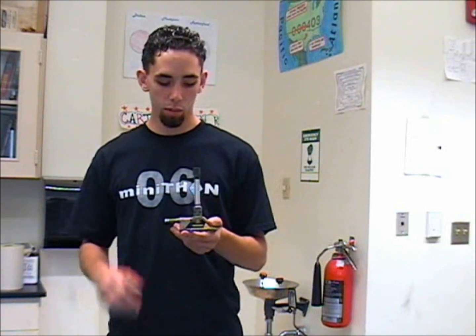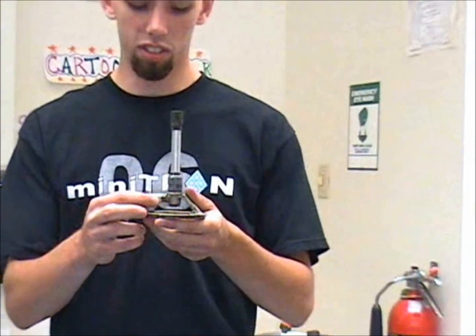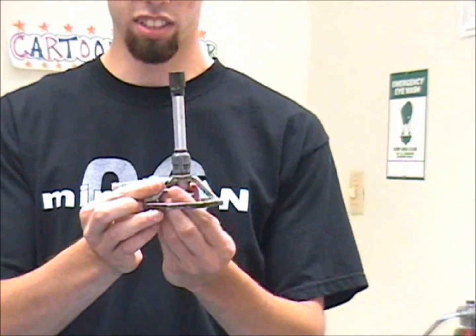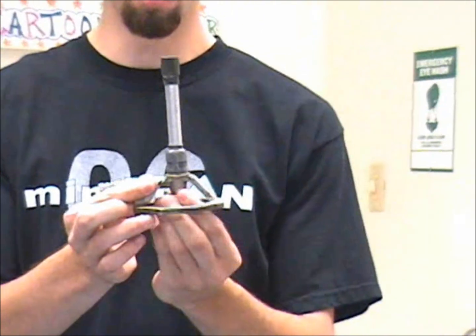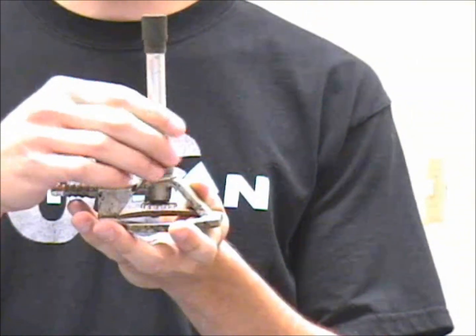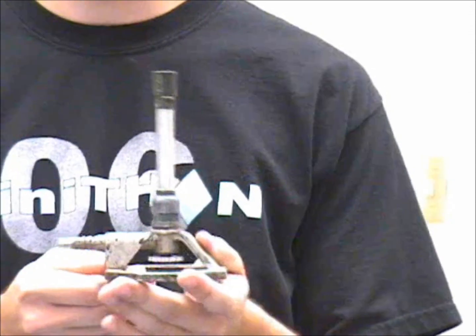Here we have a Bunsen burner. The Bunsen burner is used to heat chemicals and equipment in the chem lab. The way the Bunsen burner works is the gas travels into the burner through this chamber here. The height is determined by the gas valve down here, which easily turns. Up here is the stem, which you turn to determine the type of flame, such as yellow or blue. It determines the heat.